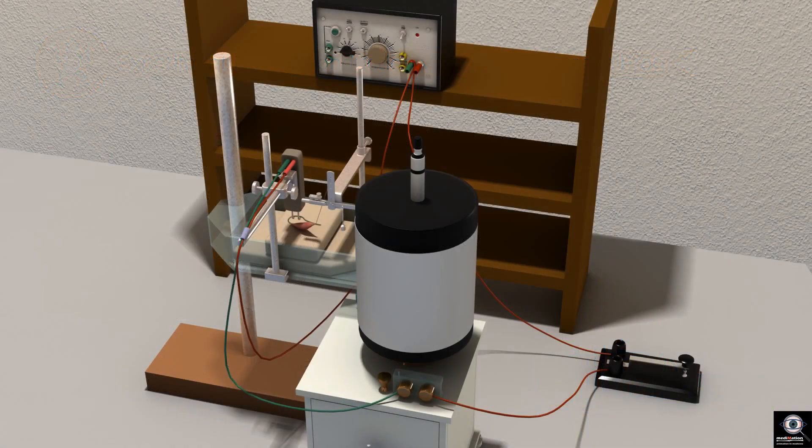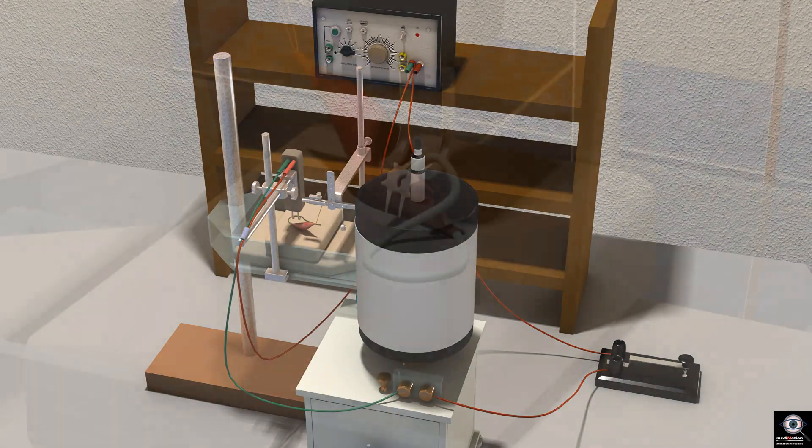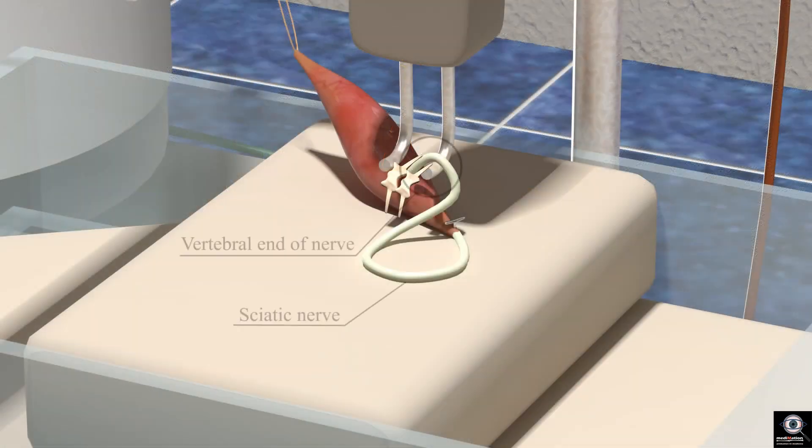Procedure: We set up the apparatus in a manner similar to the recording of the simple muscle twitch. We stimulate the sciatic nerve at its vertebral end with the stimulating electrodes.